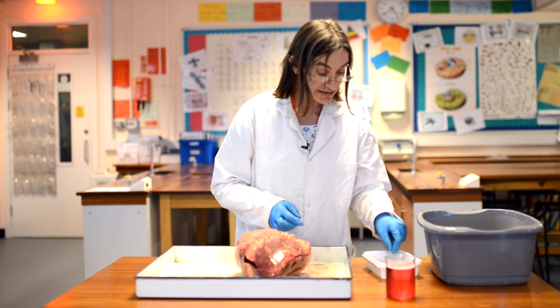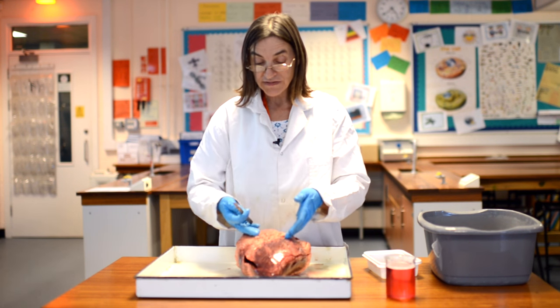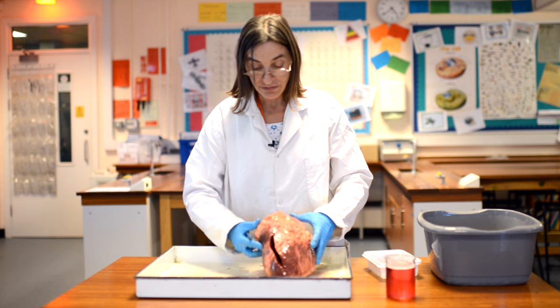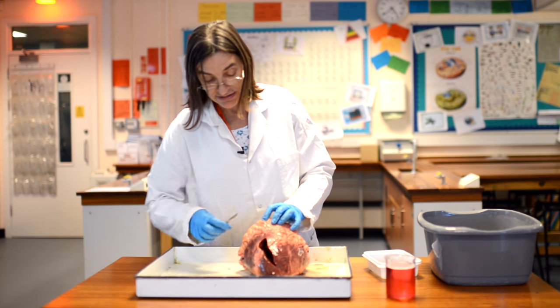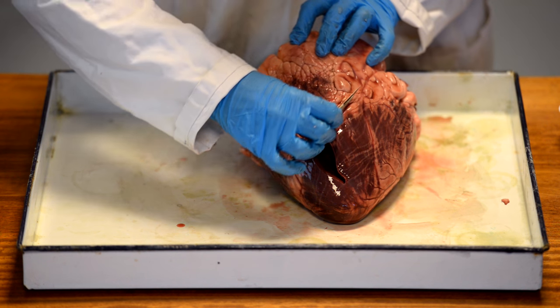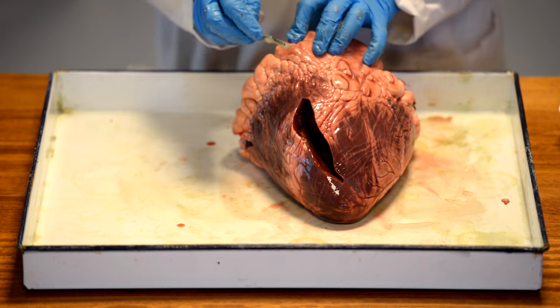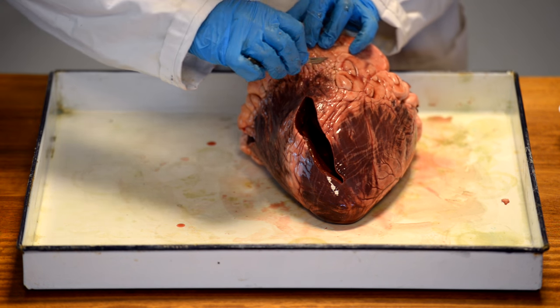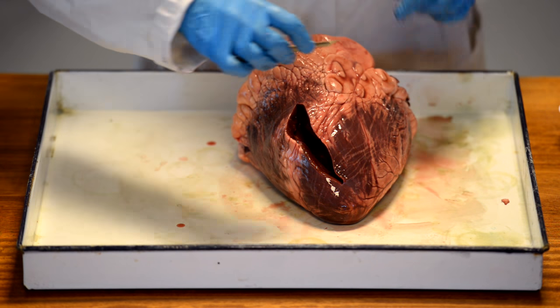Now, there's a couple of ways to dissect a heart. My preferred way is to open both sides of the heart up separately. And the butcher has already made a bit of a start, but I'm not terribly impressed with the butcher's dissection skills. So we're going to bypass some of that. What we're going to do is go either side of this major blood vessel, which, remember, is providing oxygenated blood for the muscle. I'm going to go down this side first. Actually, I might go down this side first because of that slash. This is the left-hand side.